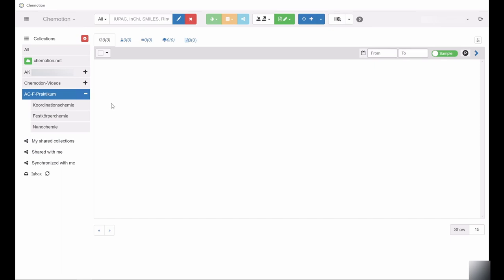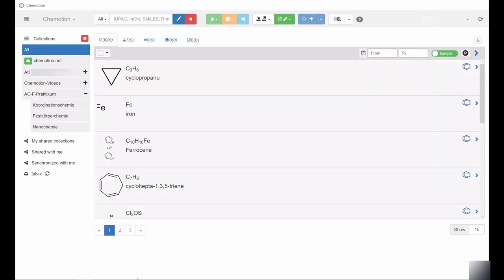All content added to the Chemotion ELN is automatically assigned to the All collection. Therefore, the All collection is not intended for editing entries and files.